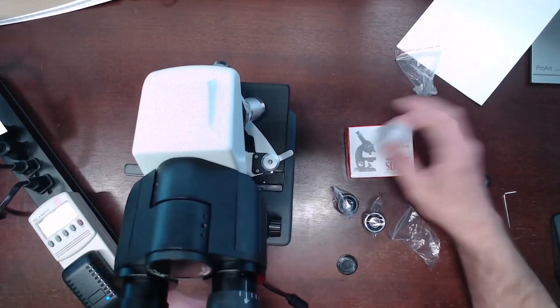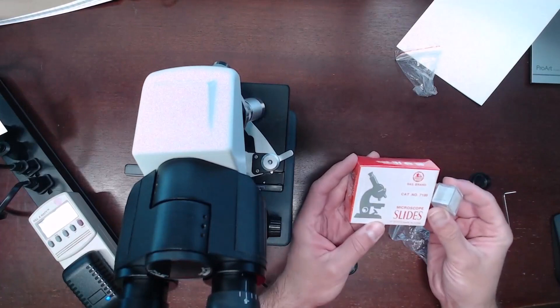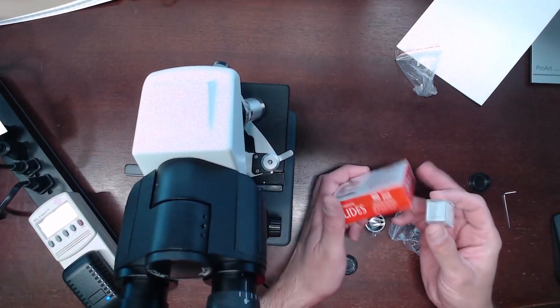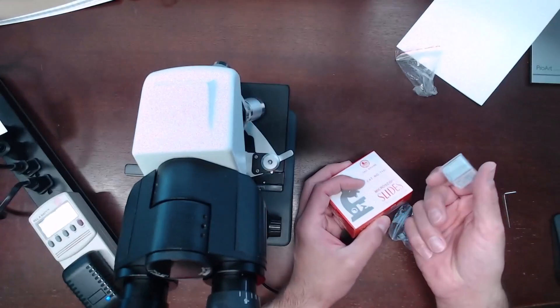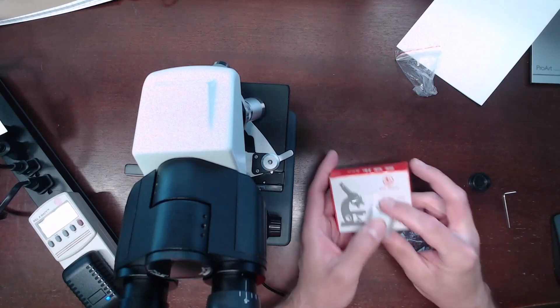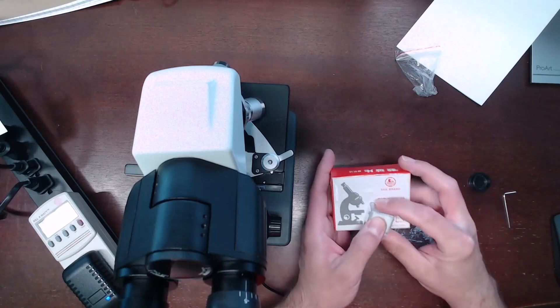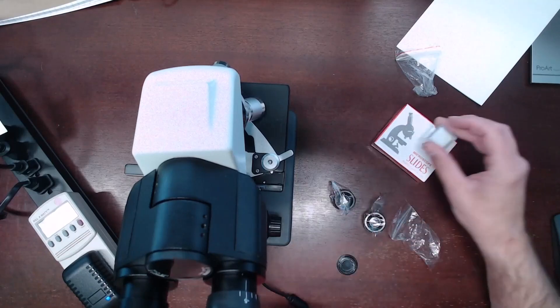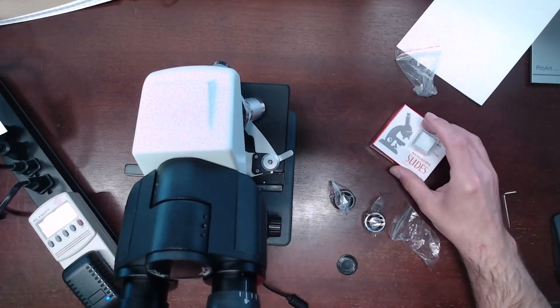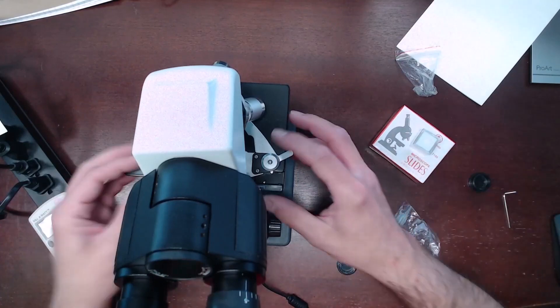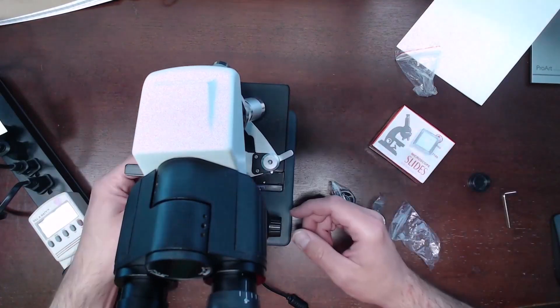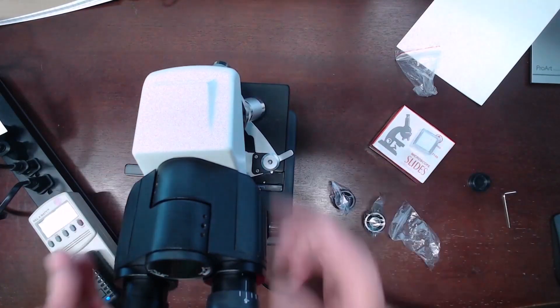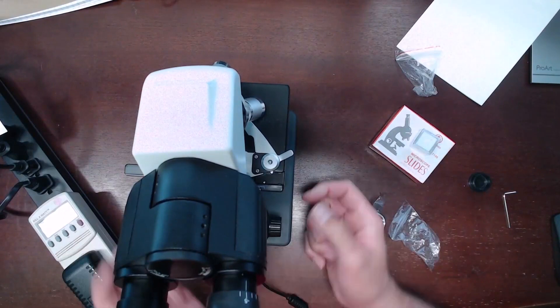You can prepare your own slides. They do include 50 of the slides and the cover glasses if you want to prepare your own slides. Or you can purchase pre-prepared slides elsewhere. You'd load your slide into the slide holder and adjust the microscope.